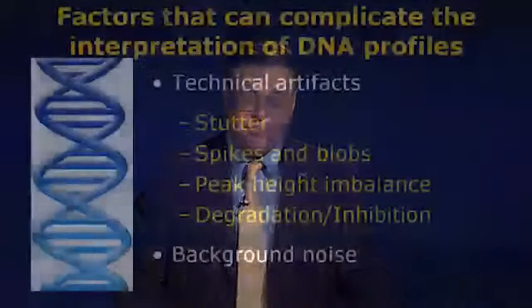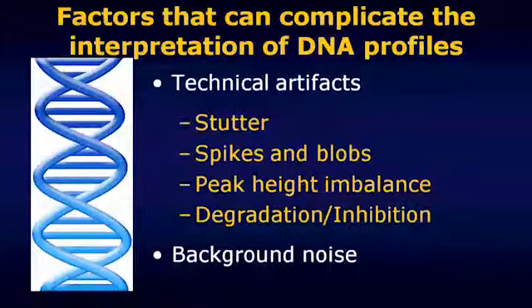But with that out of the way, let's just get straight to the task at hand, and that is talking about some of the issues that can arise in terms of artifacts and noise when we're looking at DNA profile results. This particular slide is essentially an outline of what we'll be talking about during the course of this video, and pretty much in the order in which I'll be going through these things.